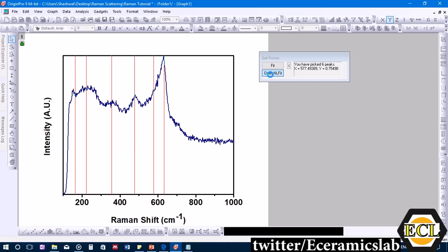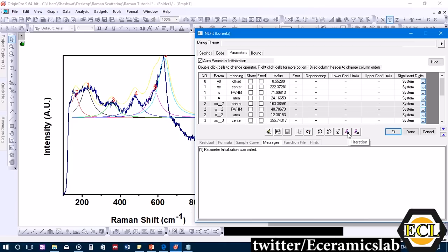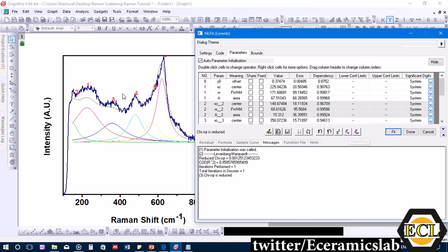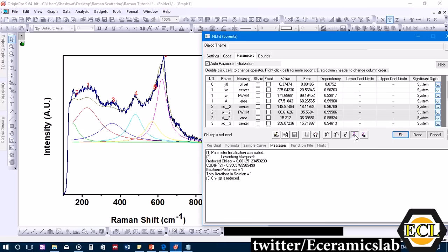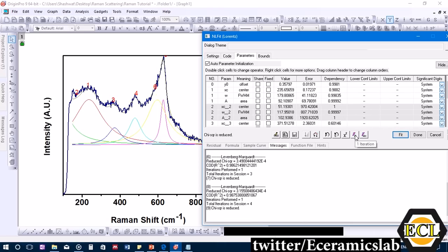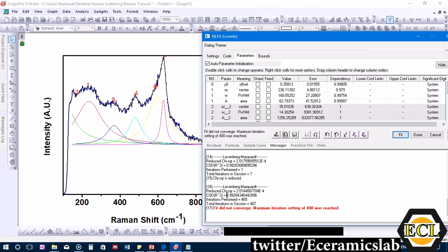We click 'Open' and begin fitting. You can step through one iteration at a time, or click 'Fit Until Converge.' We proceed iteration by iteration to describe the method. The R² value starts at 0.95 after a few steps. After clicking 'Fit Until Converge,' the R² reaches 0.99 after 400 iterations. We click 'Done.'